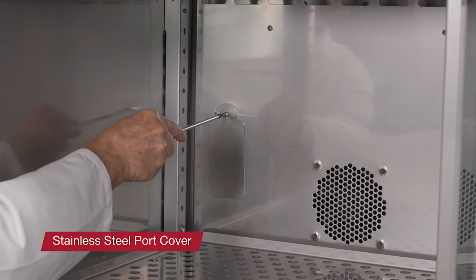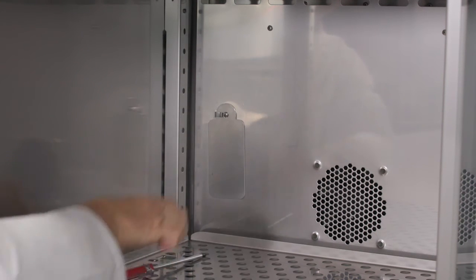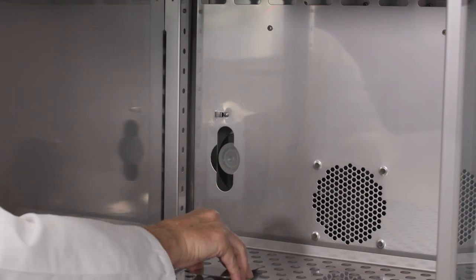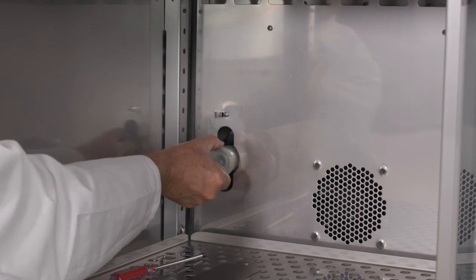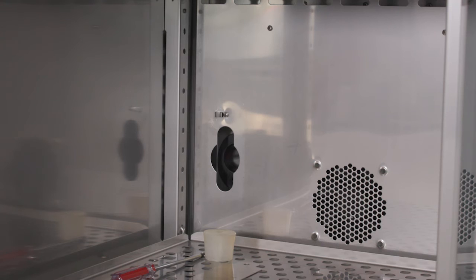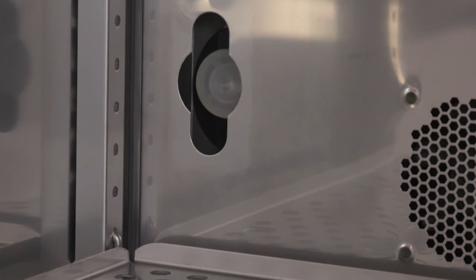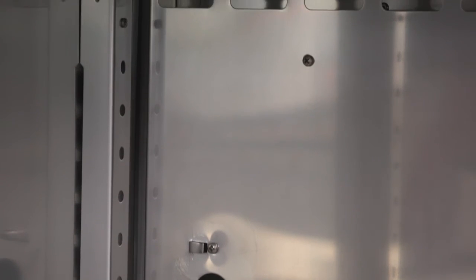The Heratherm refrigerated incubator comes equipped with a stainless steel factory-installed port cover. If you do not plan on using the port, feel free to leave the cover in place. Otherwise, remove the cover by twisting sideways to expose the port. Once the port is exposed, you can see the plastic plug. If you need to run a power cord or probe through the port, remove the plug and cut to accommodate. Ensure the plug is inserted before running the unit to protect temperature uniformity and stability.